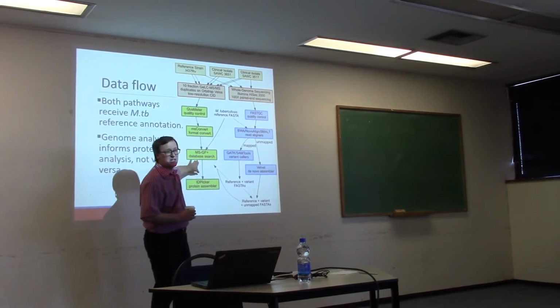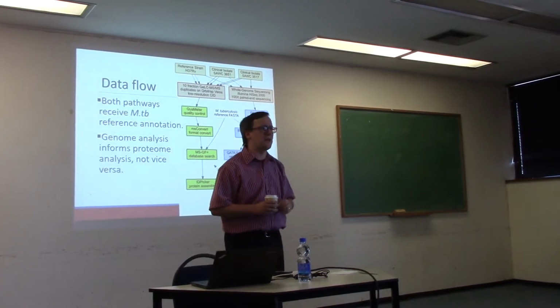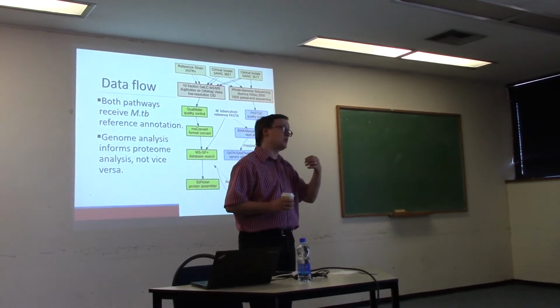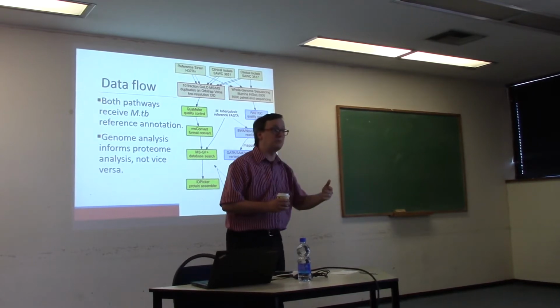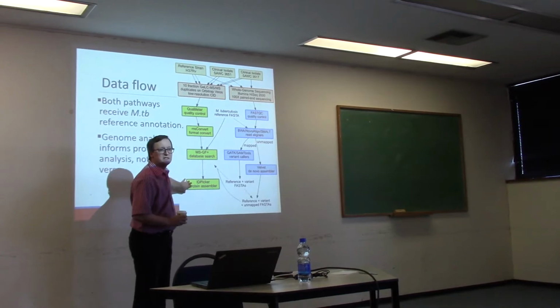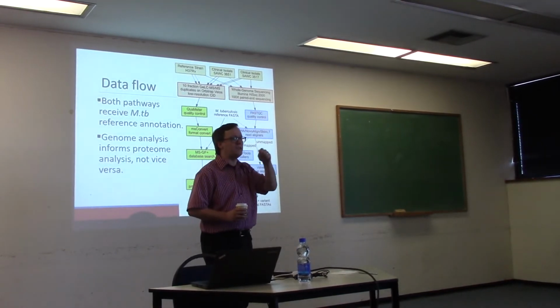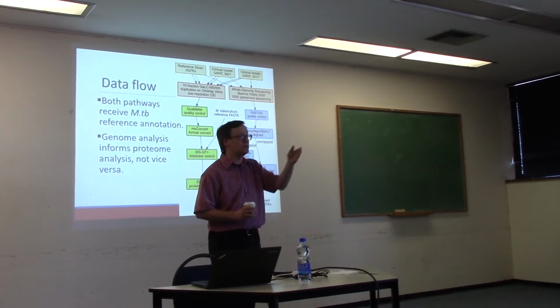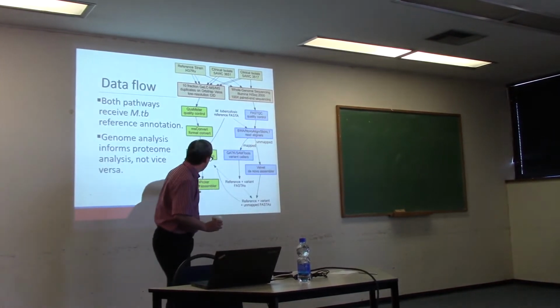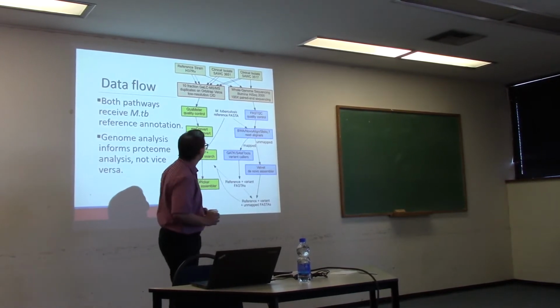We need to do database search. This is kind of the costly time step of proteomics, the ID step, figuring out which peptides each spectrum best represents. And finally, building a protein inference list that covers all of these data and helps us to see where the evidence is for this peptide or this protein across all 120 files. So it's a fairly complex inference and data management step.